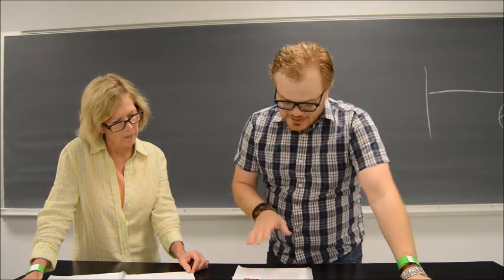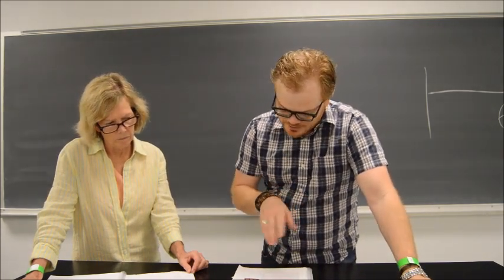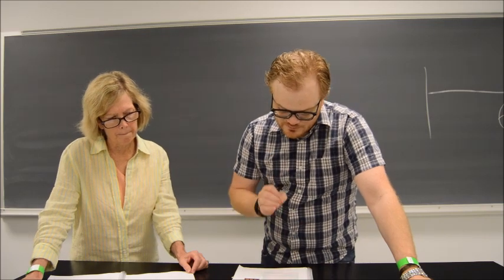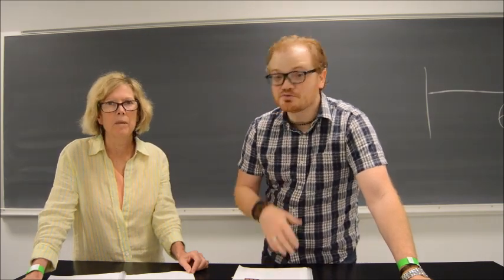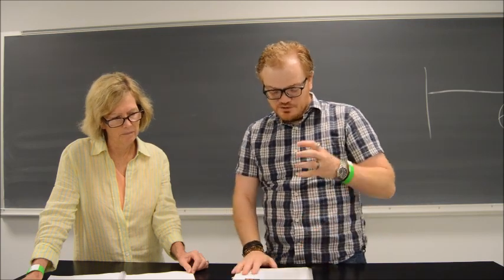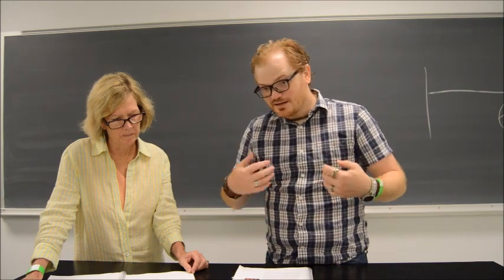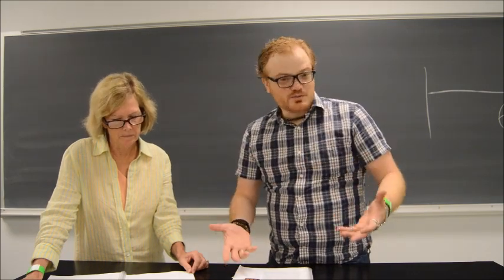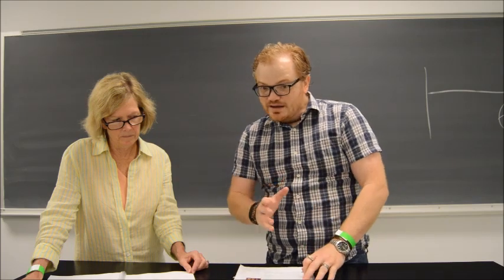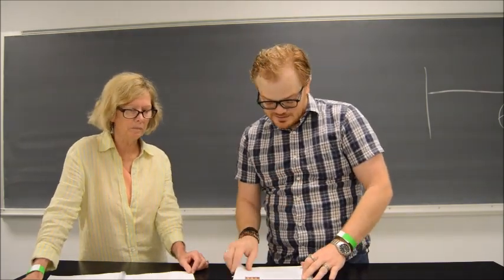Okay, so what we're going to be doing here is running some chemical experimentation, so to speak, so that we can identify specific macromolecules in solution. So imagine a world where you're presented with some sort of solution. You need to know what's inside of that. What we're going to be looking for are things like carbohydrates and lipids. In other worlds, we could do nucleic acids, you name it. There are ways in which to identify these things, and we're going to be showing you some of those today.